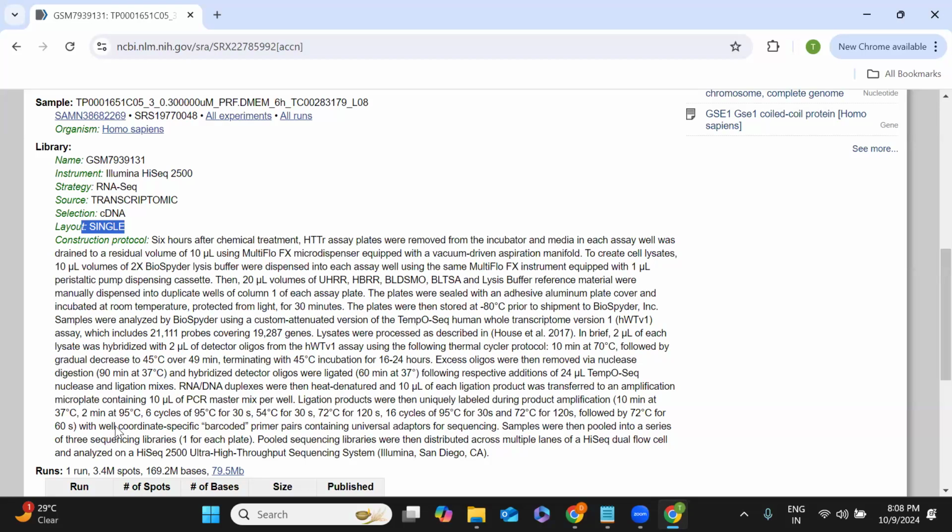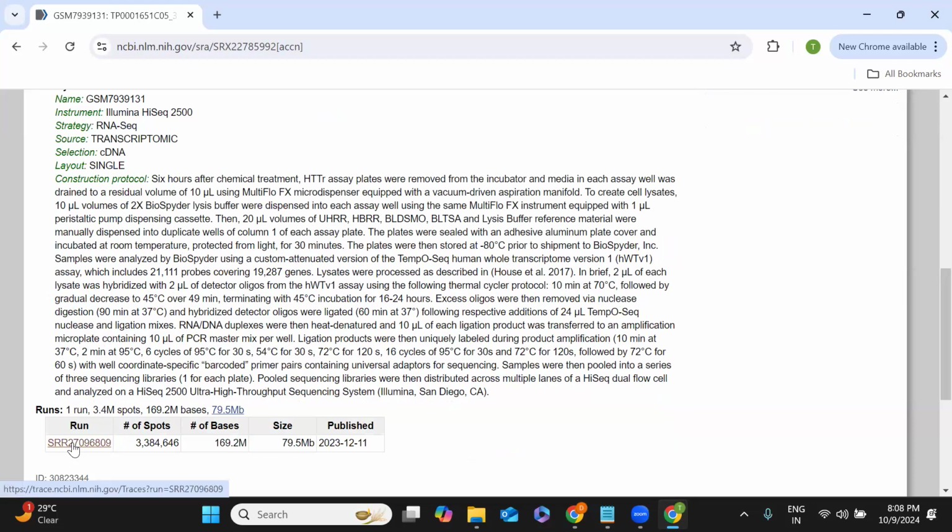Hello. Ma'am, I can't hear you, my screen is stuck. Yes, ma'am. Now can you hear me? Yes, ma'am. Okay. Now just select this run ID.